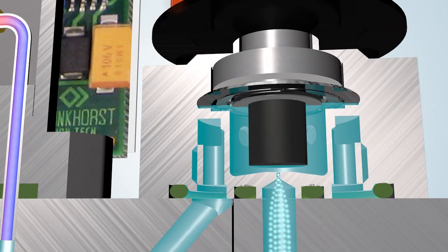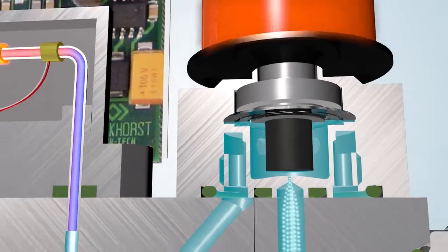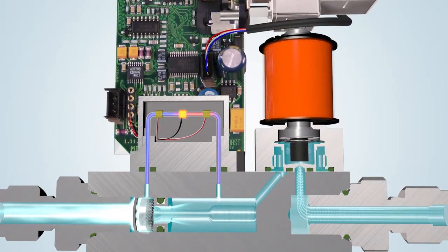The control circuit performs this operation in a few milliseconds. In this way, a very constant and stable flow of gas is achieved.